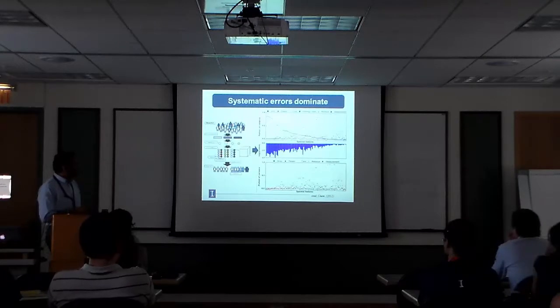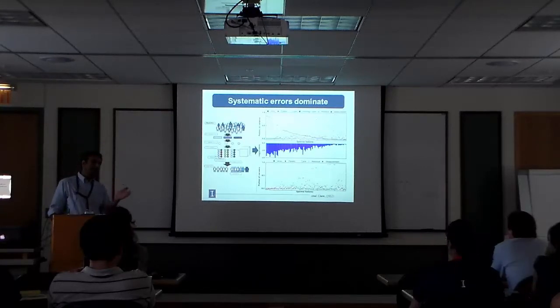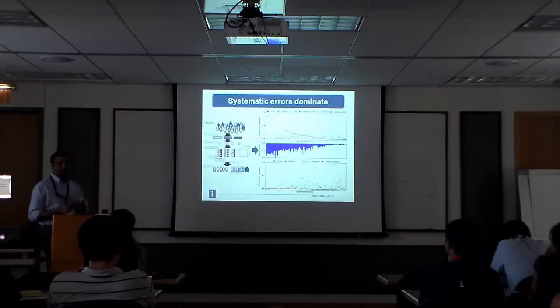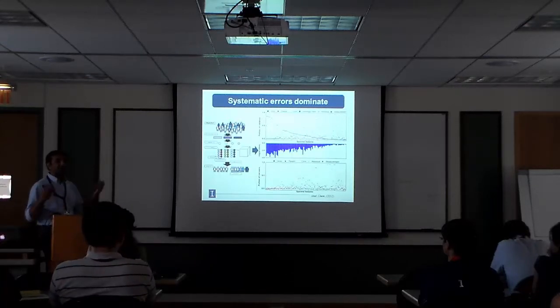Now, if you notice, the physiologic difference, though, persists for quite a bit longer. So in theory there should be at least 100, 150 features, right, which should give you better information than the biologic variability. And now what you could do with those 150 features is combine them in clever ways to offset biological variability, right? So comparing, let's say, even pairwise combinations of 30 versus pairwise combinations of 150 is just an exponentially different design space, if you will, right? So what is going on?